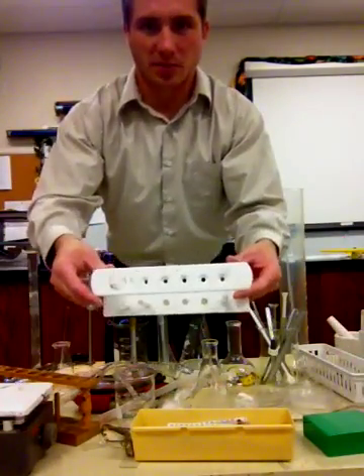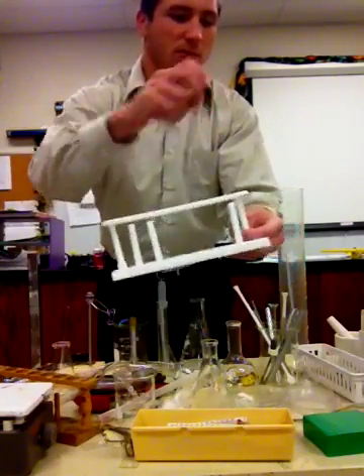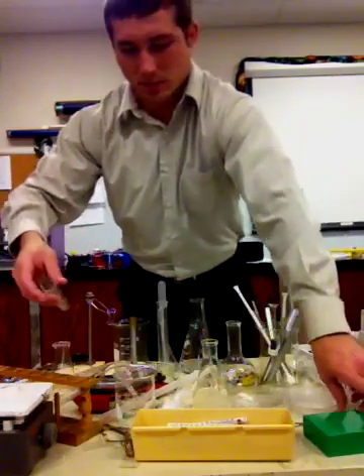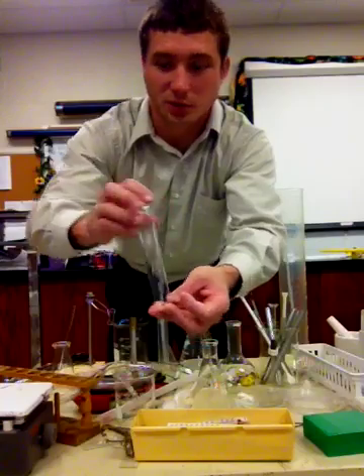Here is a test tube, and here is yet another example of a test tube rack. And this of course is your trusty old test tube.